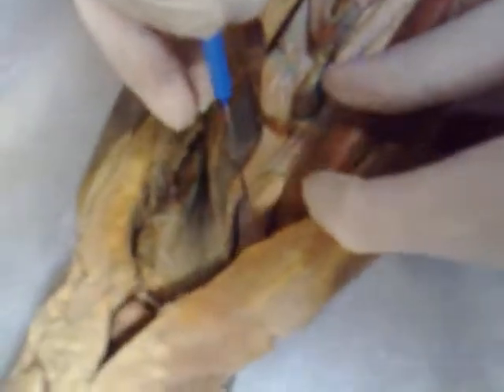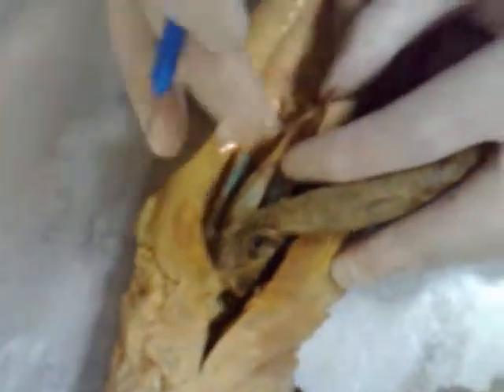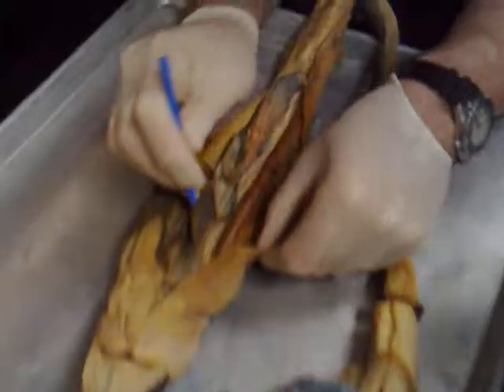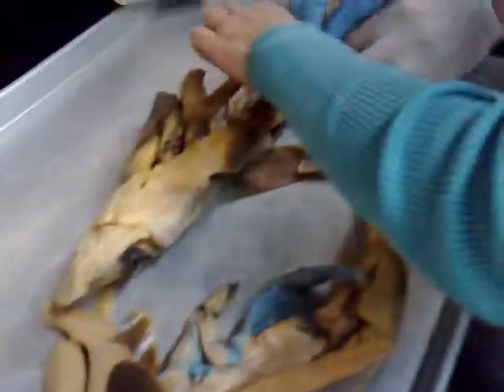Can you show me the testes? Yeah, these big guys right there. They're big. These right here — and on the other side too. They're paired on both sides, and you can tell they have this kind of ligament that's holding them suspended.